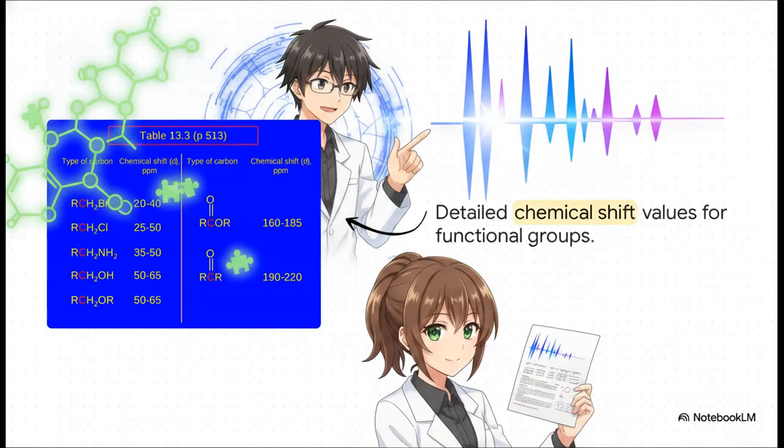In the real world, chemists actually rely on super detailed reference tables to match the chemical shifts of their peaks to these established ranges. It's like having a cheat sheet. This lets a researcher look at the data and definitively reverse engineer the structural environments of absolutely every unique carbon in their sample, snapping the whole molecular puzzle together.